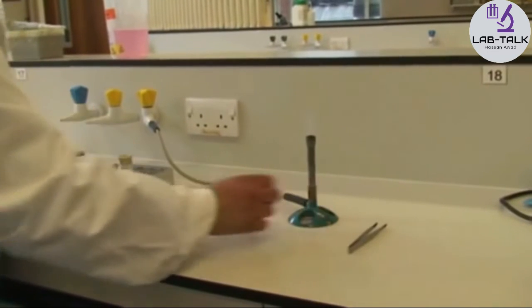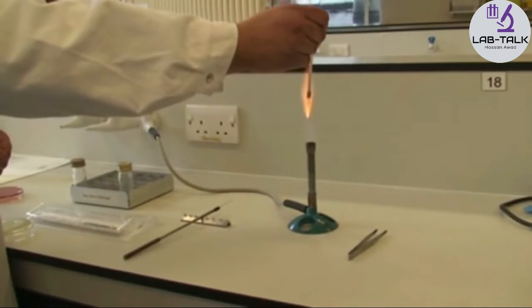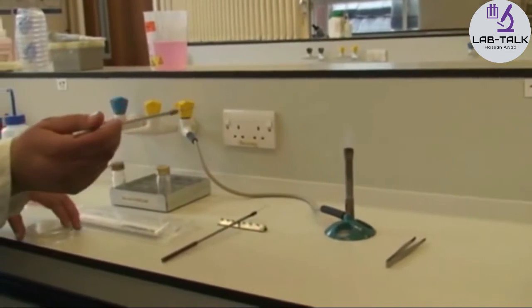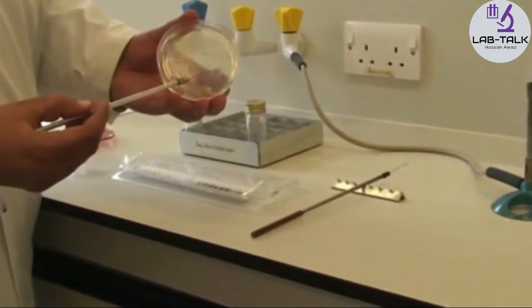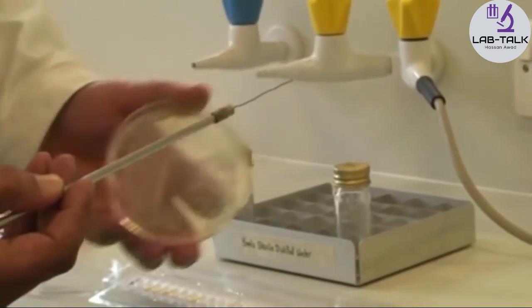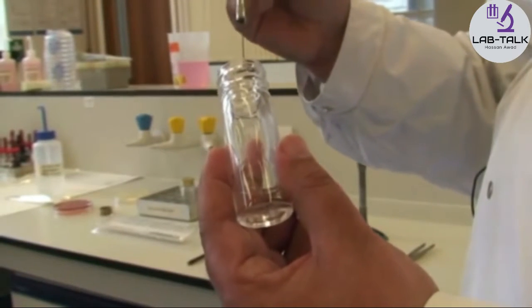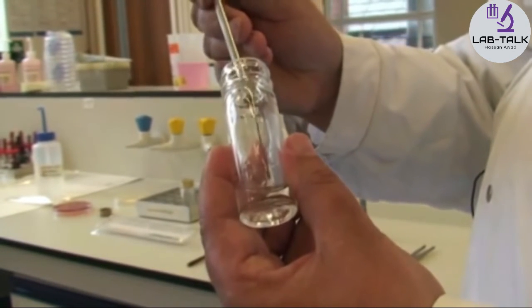Flame the straight wire until it's red hot to sterilize it and get rid of any bacteria. Give it a few seconds to cool down, then pick the colony into the sterile distilled water — you should have quite a bit on the edge of the wire. Then bring the straight wire inside the universal and emulsify a little bit in the distilled water.